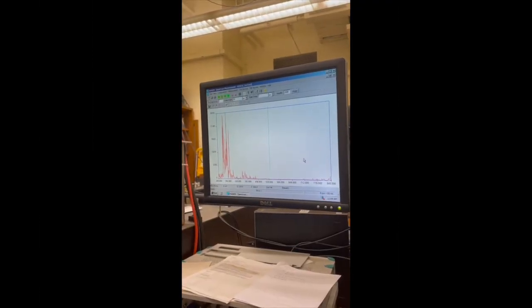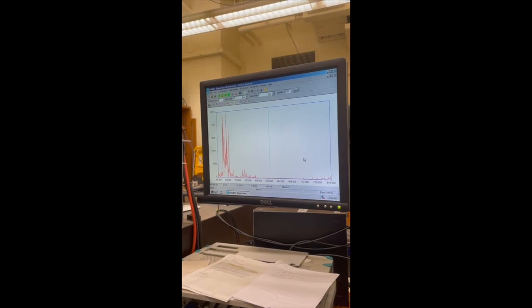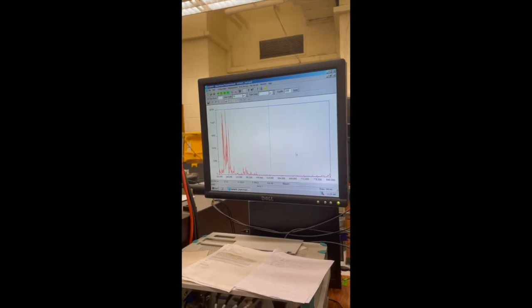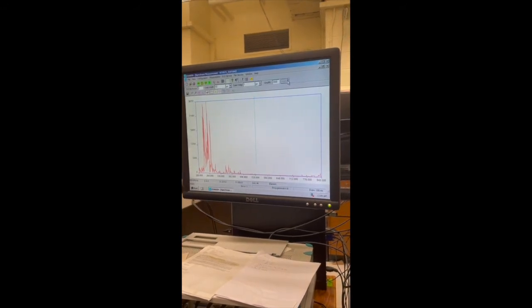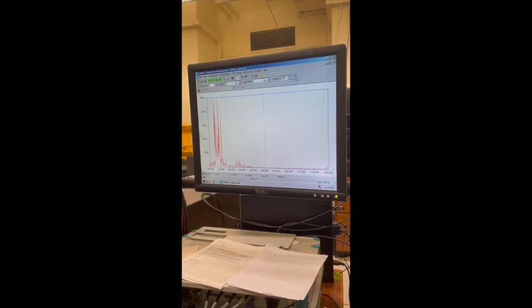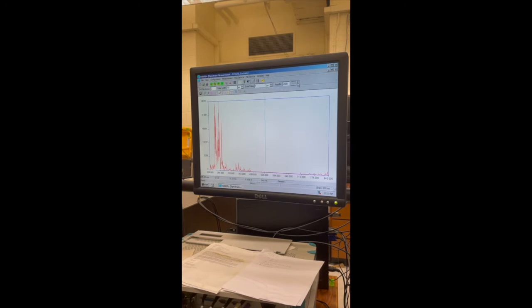Okay, so now we can actually play around with some of the other settings, although those are our nominal steel calibration settings. So what happens if we set the on-chip accumulations to 2? Increase that, and then I'm going to click apply. If we do that, you're now going to hear 4 shots fired, but 2 of them are going to be added together to make the spectrum. So we actually expect a spectrum to be roughly twice as big as this one. Let's just see what happens.